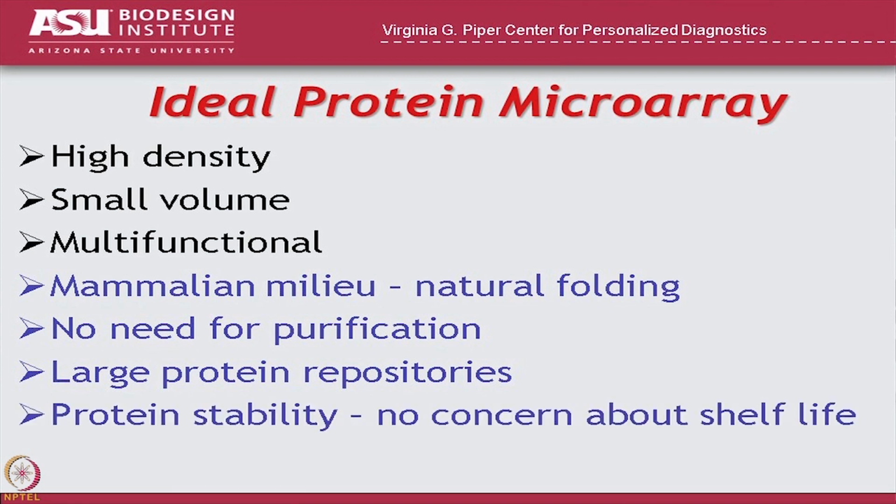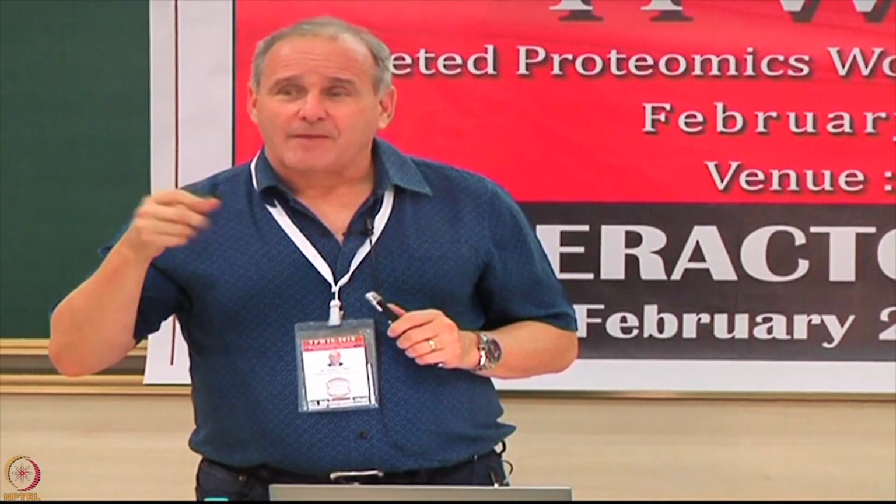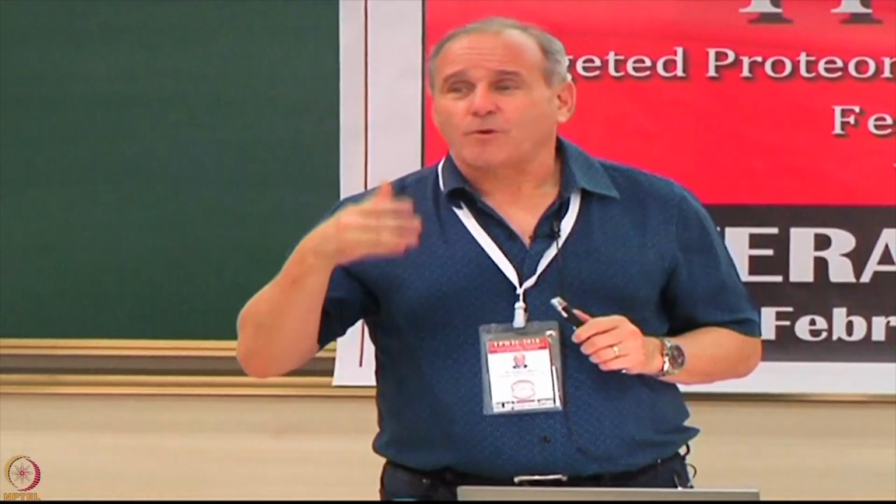And you'd like to not worry about the shelf life of the protein. Once you print the protein on a chip, there's always this worry that the clock is starting. And the longer it sits there, the more likely it is to stop being active or being well folded.